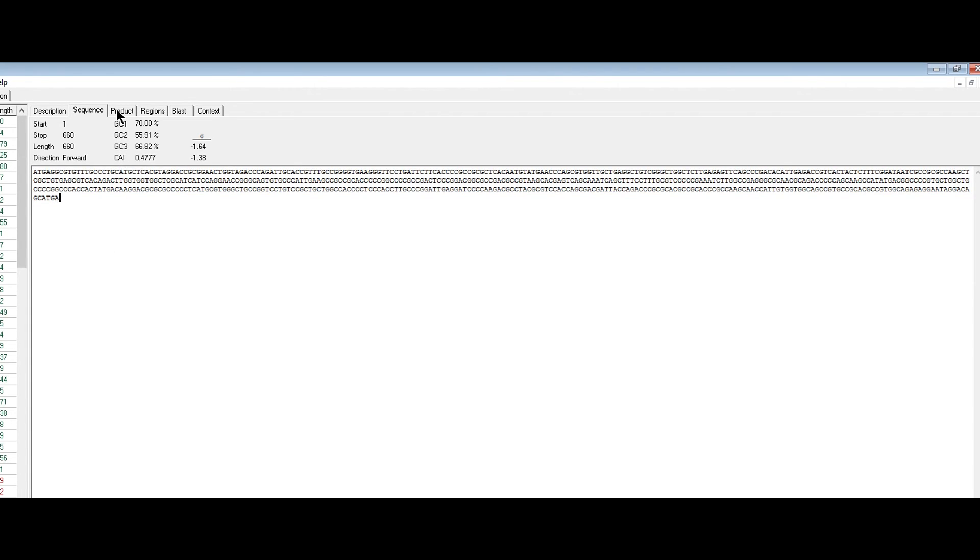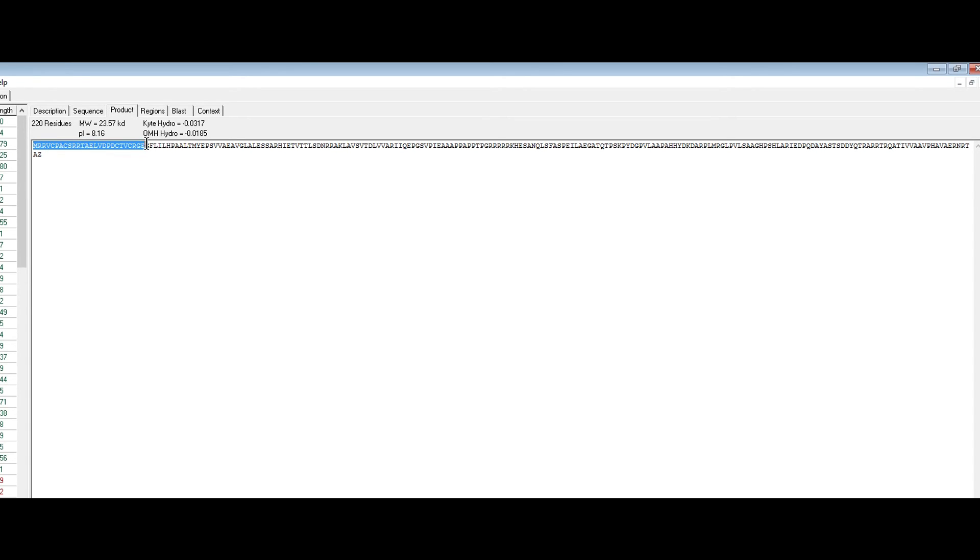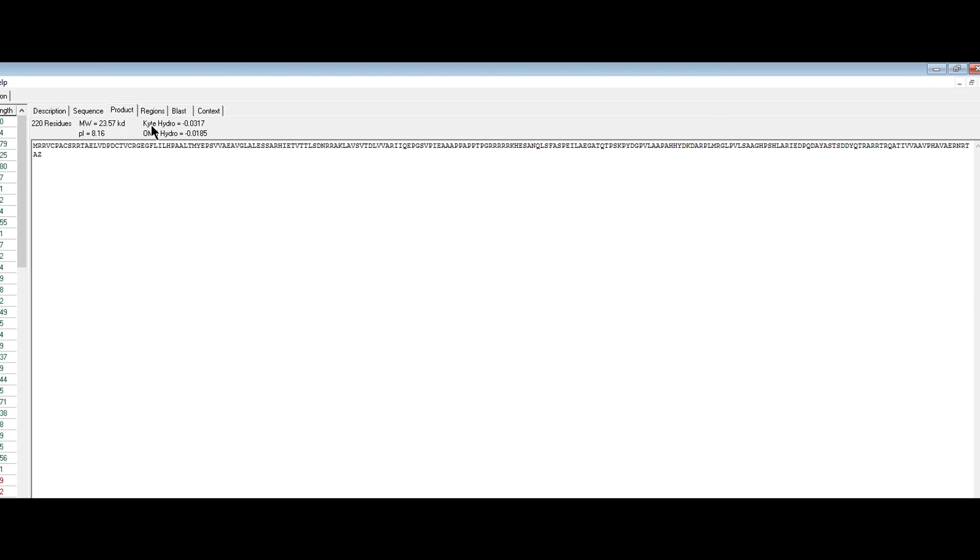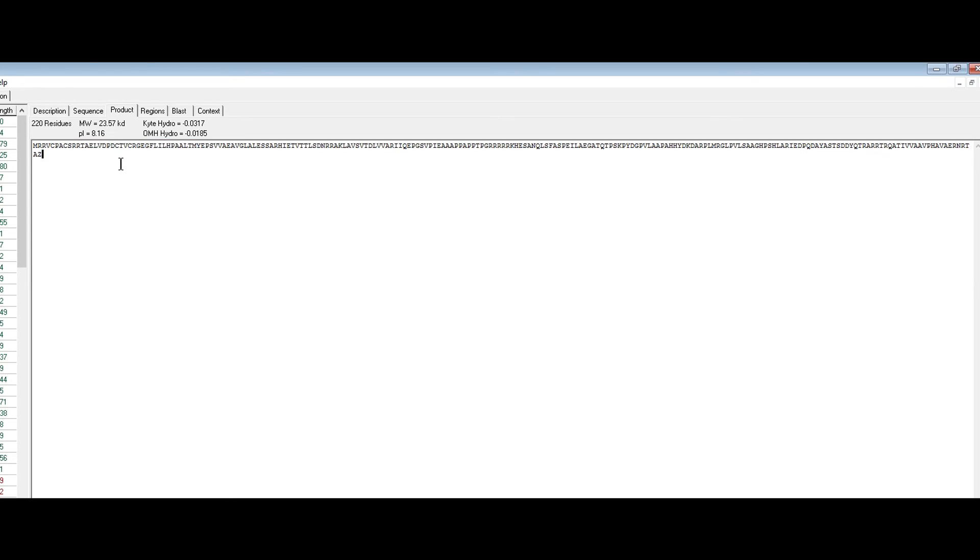If you want the product, you click the product tab. It tells you how many amino acids are in this gene. Here, 220 residues or amino acids are present in this gene, and here is the amino acid sequence. This product tab will be especially important when you're blasting or putting these into databases to match up to see if there's a possible function for your gene.